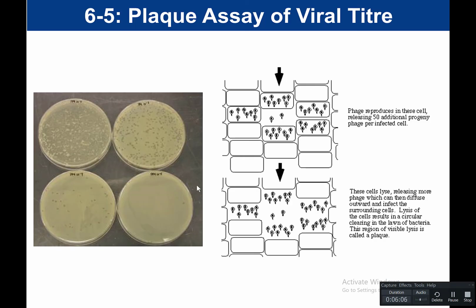You are correct, because your 10 to the negative 4 is the most concentrated of your virus. It's the highest concentration. It's the lowest dilution. So this would be the equivalent of our 10 to the negative 4. This would be our 10 to the negative 5, 10 to the negative 6, and 10 to the negative 7. And so we would look at our 4 plates. And just like our standard plate count, when we're determining our titer, only one of these 4 plates is going to be used. And so let's look at how do we determine our titer.